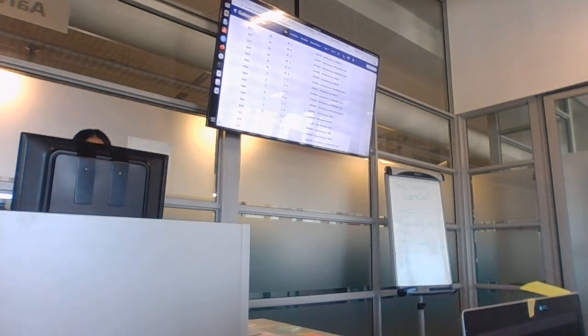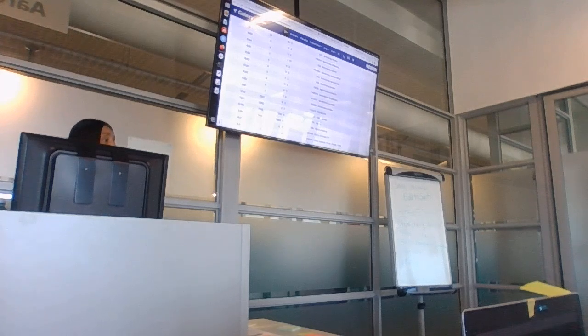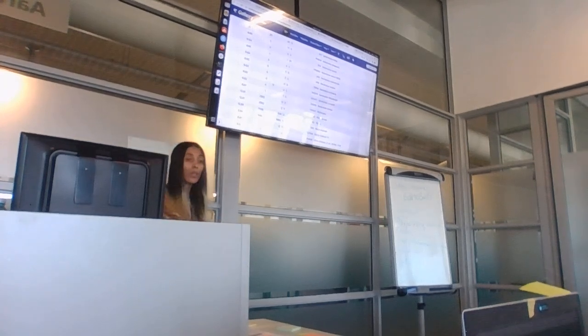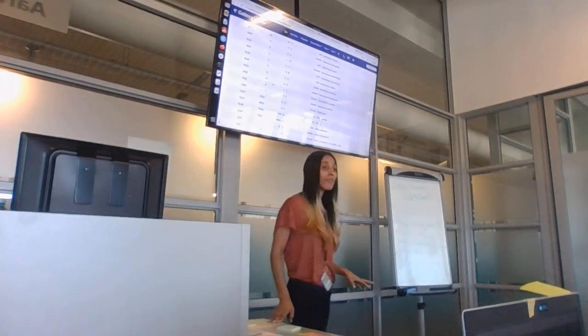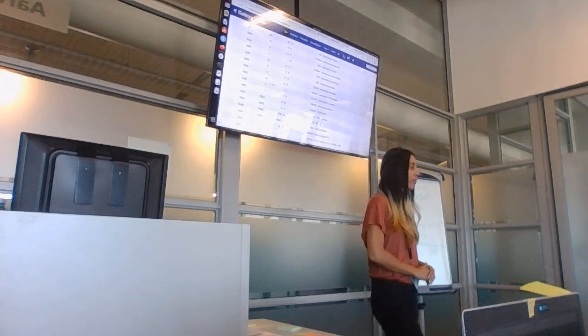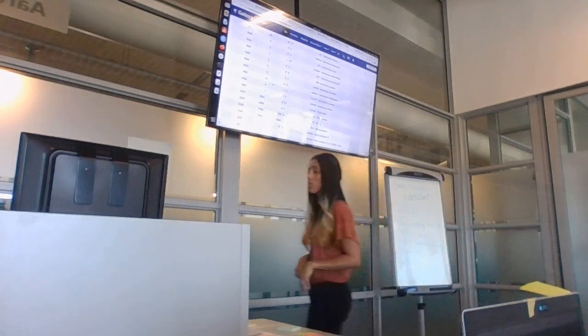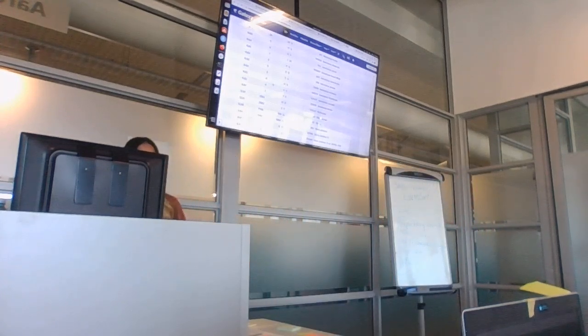You can see this is Aeromonas species, and then if you look, 12% of this really is actually cholera. The rest is a different species. Vibrio cholerae. If you actually do a quick Google search, you will see often a false negative. Yes.